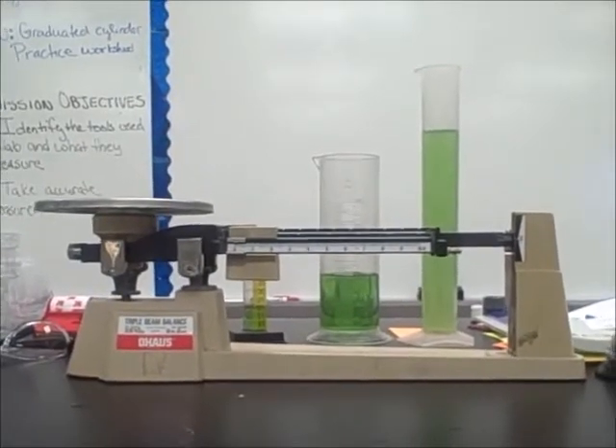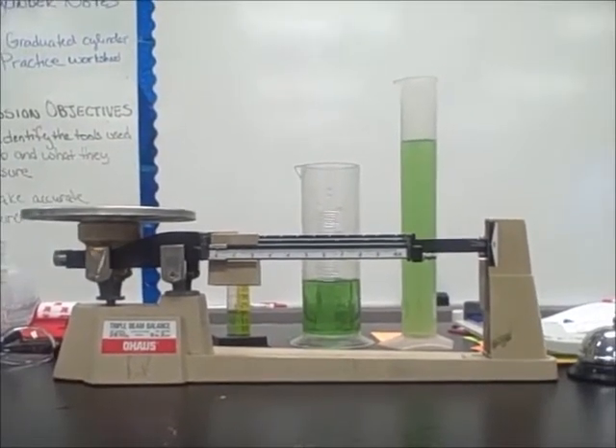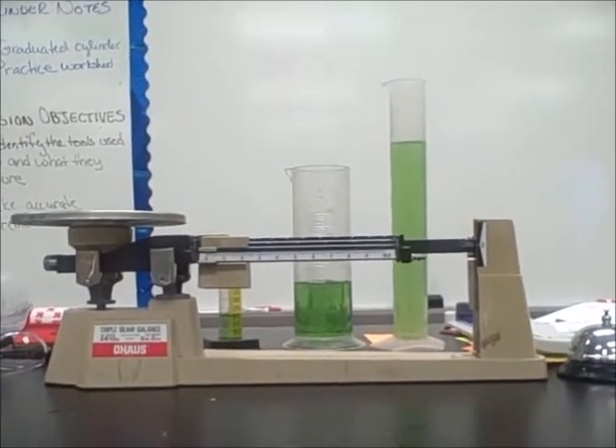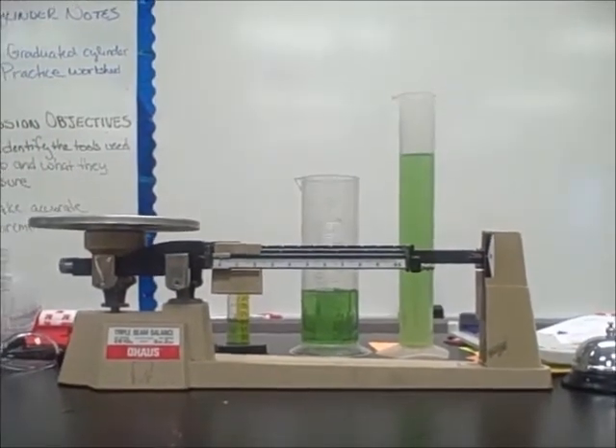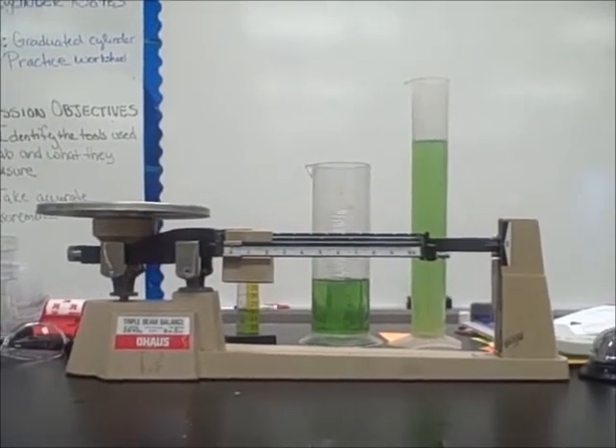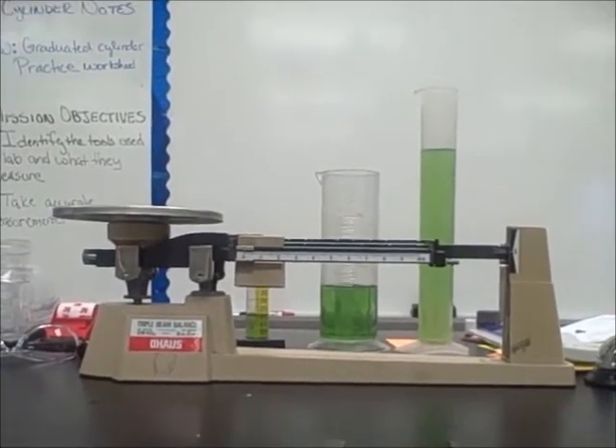Today we're going to talk about the triple beam balance. For our normal labs we won't necessarily be using the triple beam, but it's kind of nice to see what scientists used to use — and some actually still do use it — and then to see where we've progressed from there.